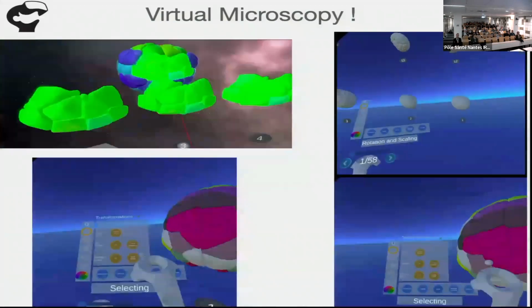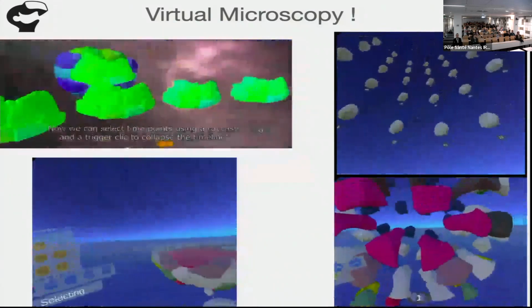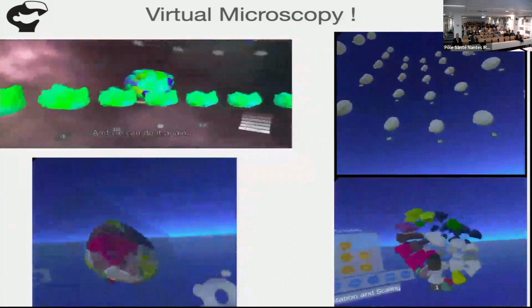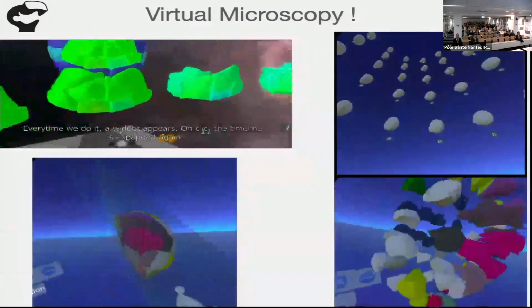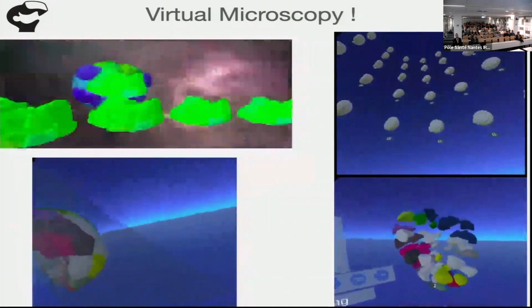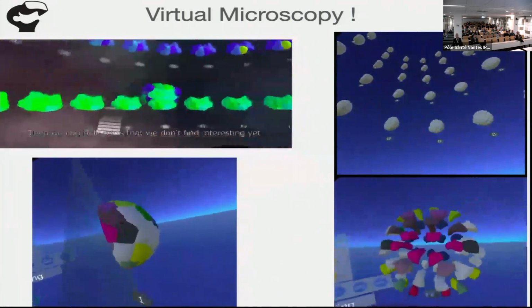So we have some videos already that are work in progress. So this is, for example, all the time that you can see in a spiral around you, all the things that you can cut with your hand and see what happened inside. So this is not on raw data. This is on segmented data. The project starts in January actually. So this is here the times around you, etc. So if you're interested, we can discuss that later.